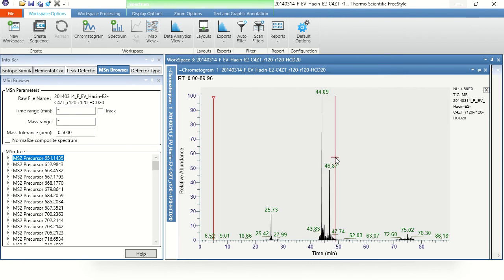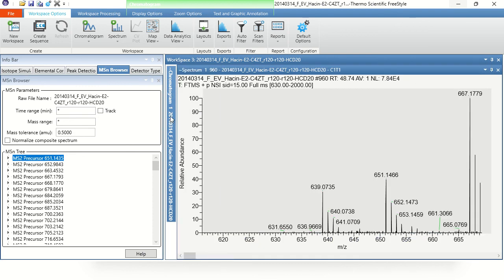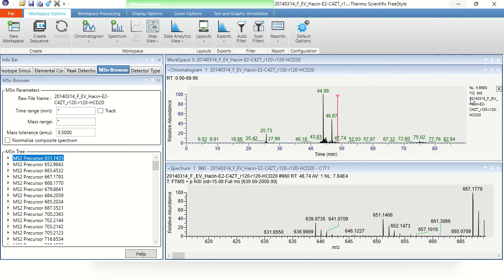Here I see that I wanted to look at a particular scan number within this. Oh, I need to actually turn off its auto hide because I've been grouching about it and now I need the software to show it properly. And maybe if I'm very, very lucky, I will get the mouse in just the right spot and turn that off. Okay, auto hide is back.